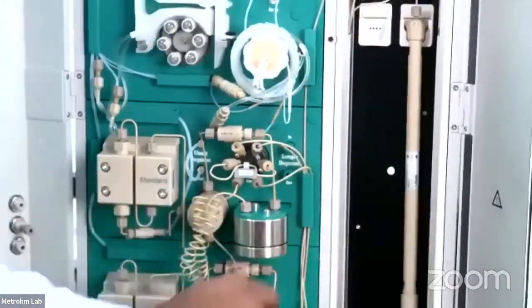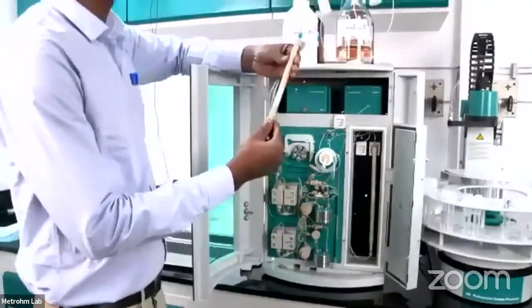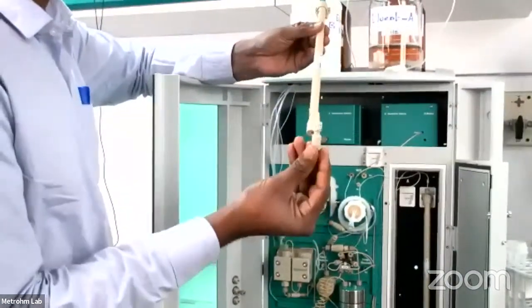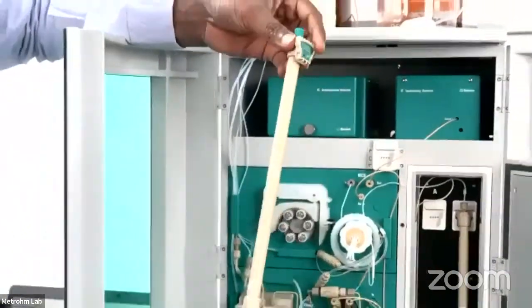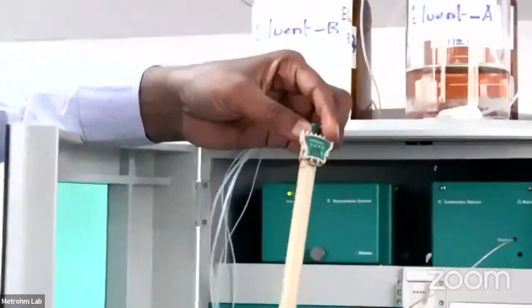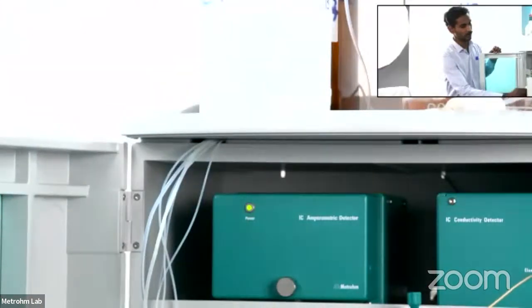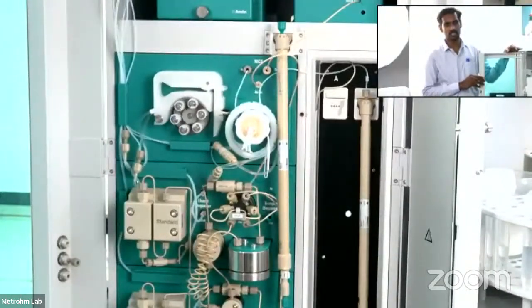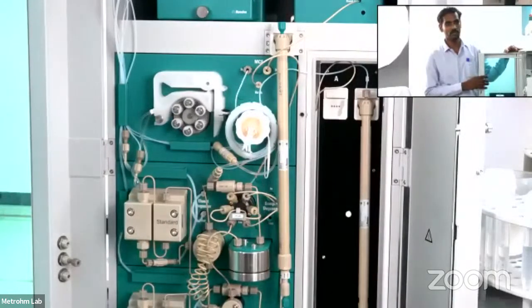So this is the column compartment. Right now the instrument is running. You can see this is the column, the ion exchange column. This is actually the guard column, attached to the main column to protect the main column. Our Metrohm columns are i-Columns. You can see this is the chip on the header. An i-Column means an intelligent column. Once it is connected to the instrument, it will recognize what column it is, what flow rate this column can operate at, and what default eluent can be used for this column.